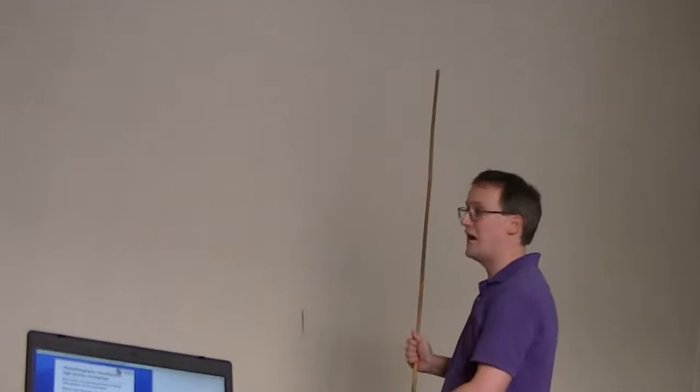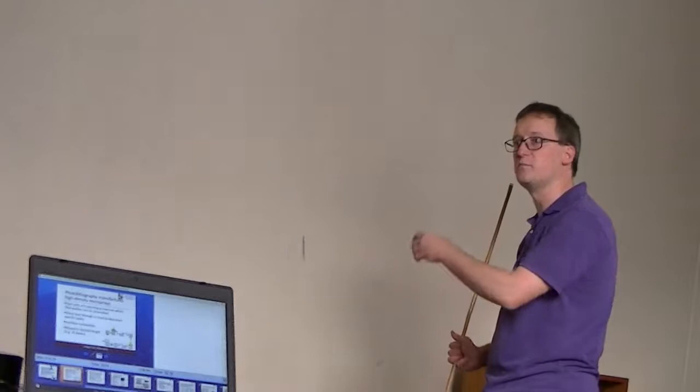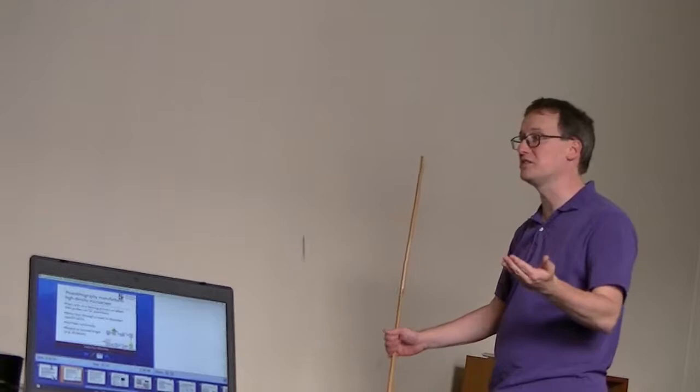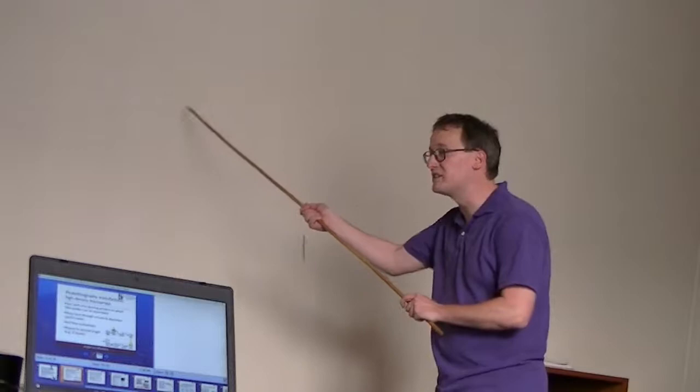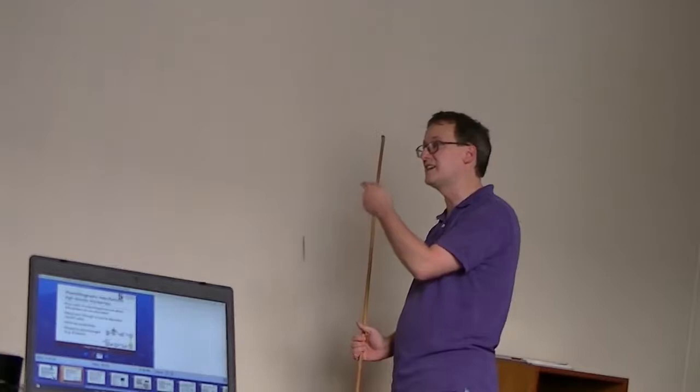I'm doing this for all, you know, million spots that I have on this array at once. This is really kind of magical. Then I apply mask, and once again I shoot off wherever I'm going to add, let's say, a T. Now I have a few places on this surface that have the mask burned off of them. I throw on a glob of T, let it attach, remask. And you keep doing this until you have a length of about 25 nucleotides on any one spot of that surface. This is how we make transistors for microprocessors. This is how we build sequence probes on synthesized microarrays.